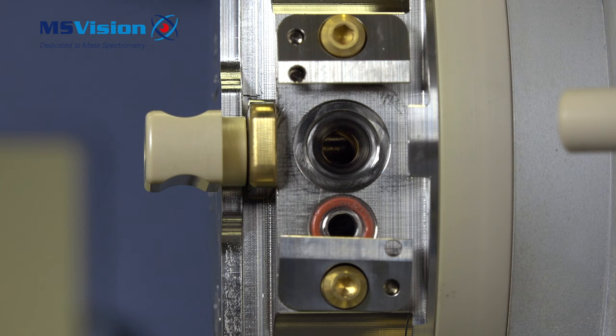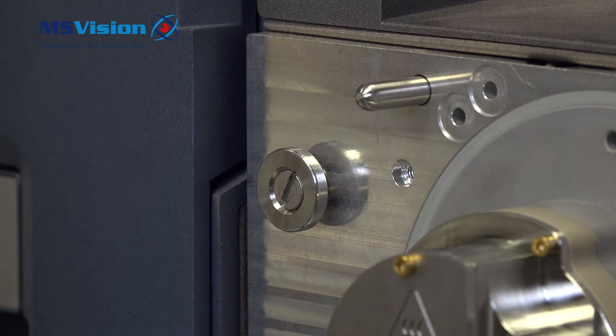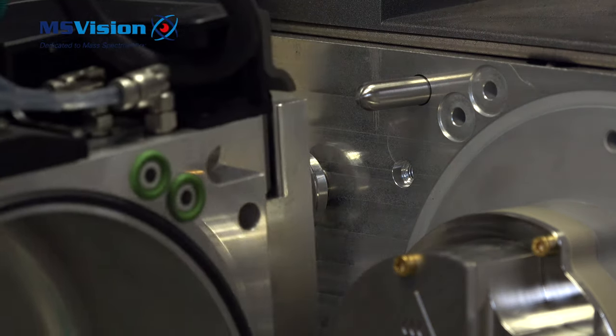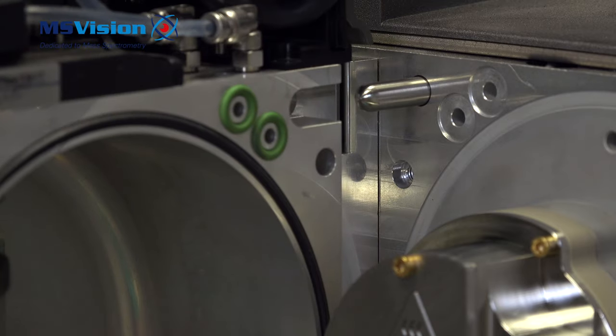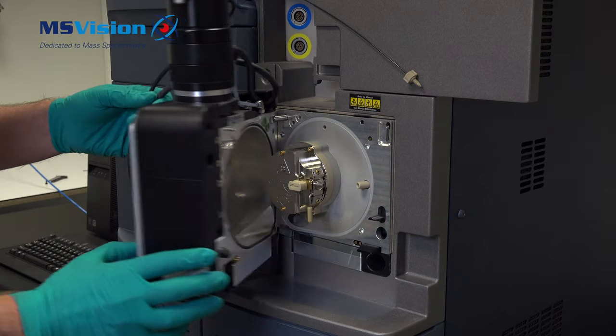Do not do this when the system is under vacuum because your turbo pumps will be heavily stressed and may become damaged. Line up the hinges and push down. Then close the enclosure door.